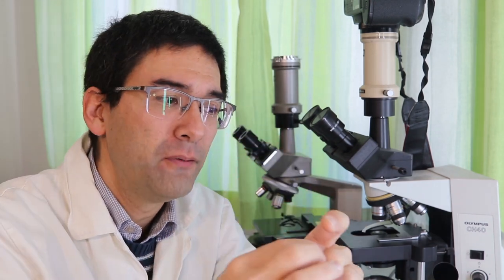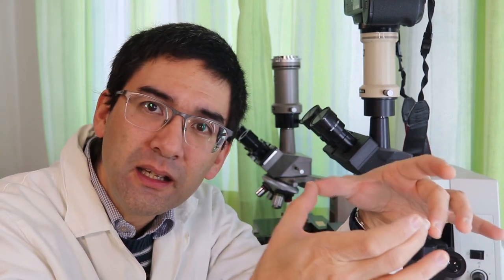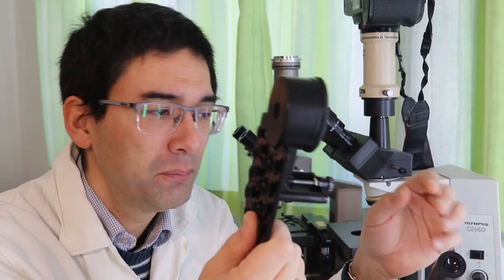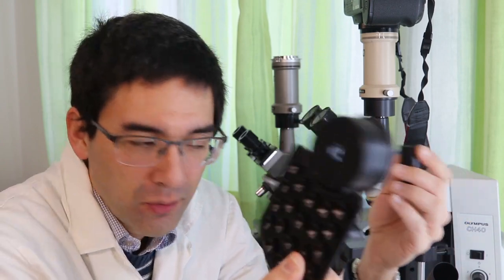And so the whole purpose of a good adapter is a little bit defeated because I don't have the benefit of it. So what I still see is a small circle, but if I'm able to hold the mobile phone by hand, as I showed you, then I'm actually getting a much larger view, I'm getting the full field of view. But I have to do this by hand. I cannot get the full field of view with this adapter because the eyepiece and the adapter, well, they're not matched.